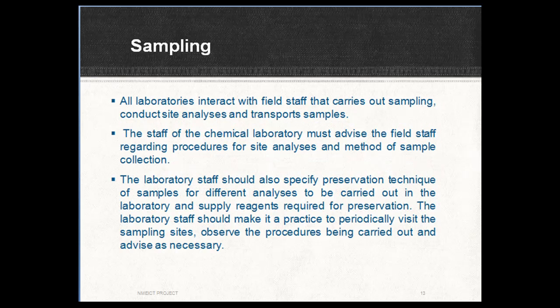Then comes the sampling. All laboratories interact with the field staff that carry out sampling, conduct site analysis and transport samples. The staff of the chemical laboratory must advise the field staff regarding procedures for site analysis and method of sample collection. The laboratory staff should also specify preservation techniques of the samples for different analyses to be carried out in the laboratory and supply reagents required for preservation.